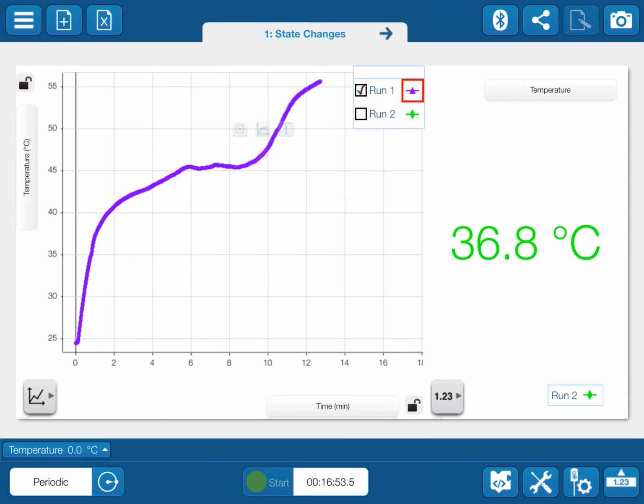And then you should again see another pretty steep slope going upwards. This point right here where you get the beginning of the steep slope typically corresponds with the point when the lauric acid is just about done melting. And that's why it starts to increase again like that.